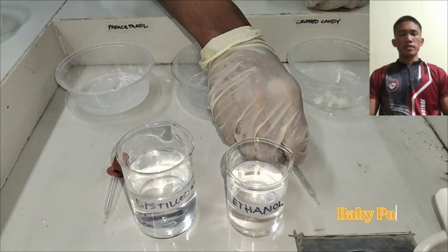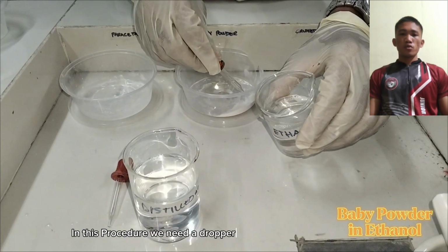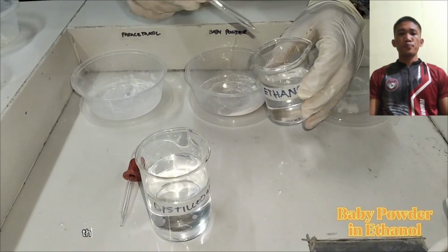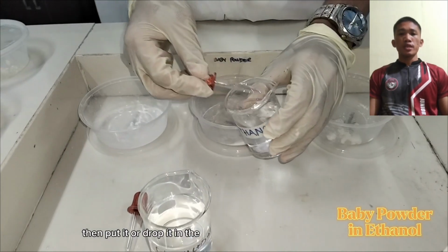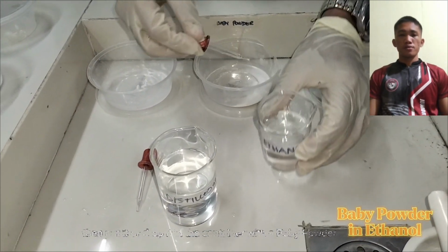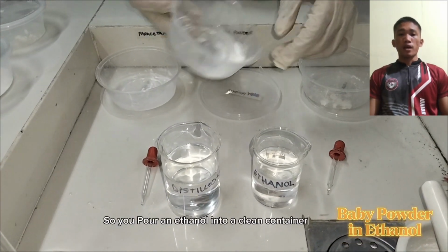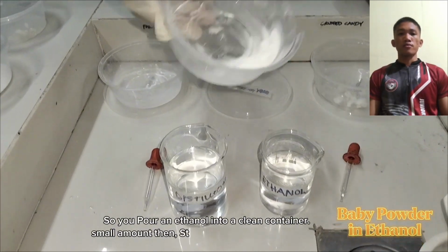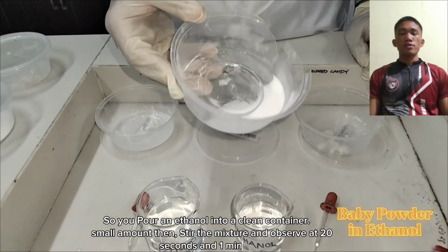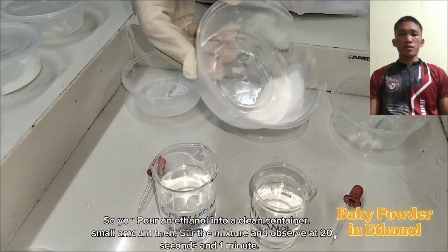Baby powder and ethanol. So in this procedure, we also need a dropper to get some ethanol and then drop it in the container with baby powder. So you pour a small amount of ethanol into a clean container. Then stir the mixture and observe at 20 seconds and 1 minute.